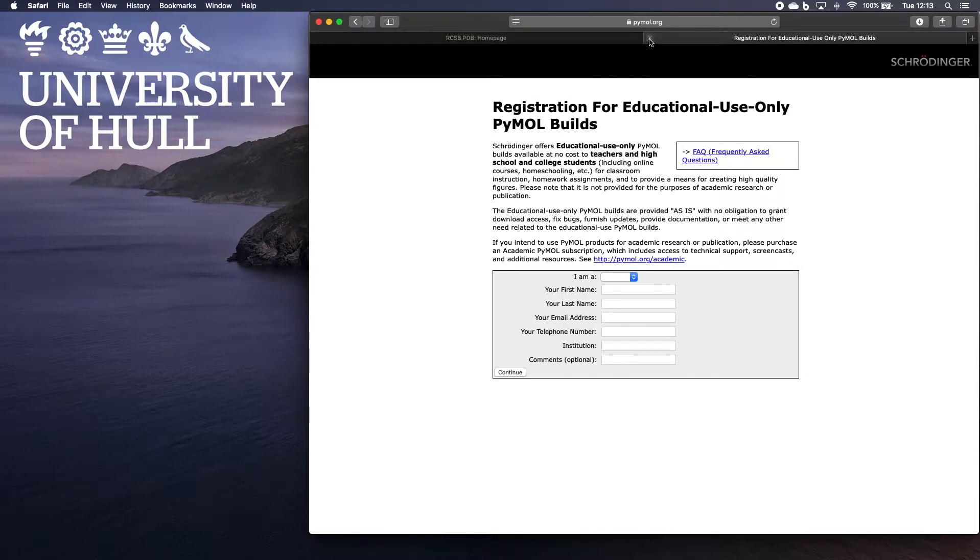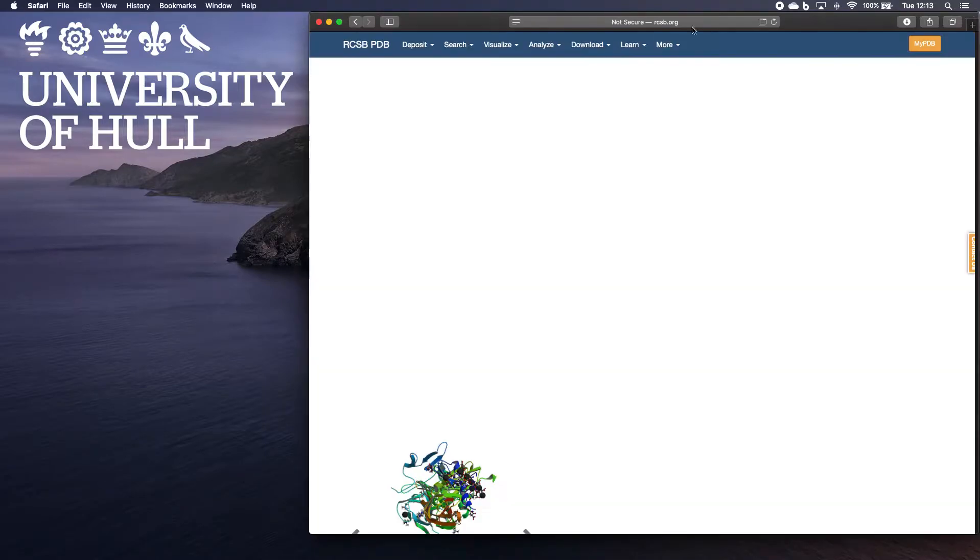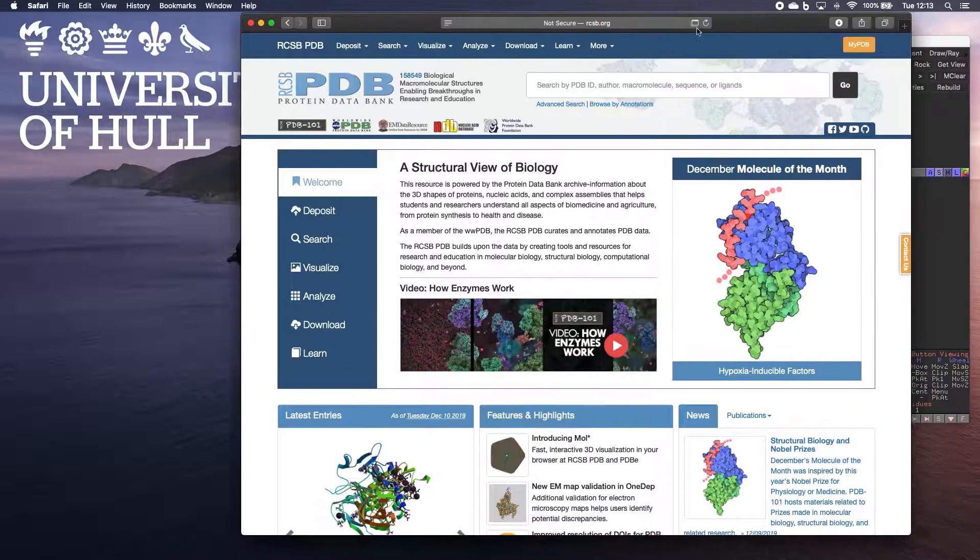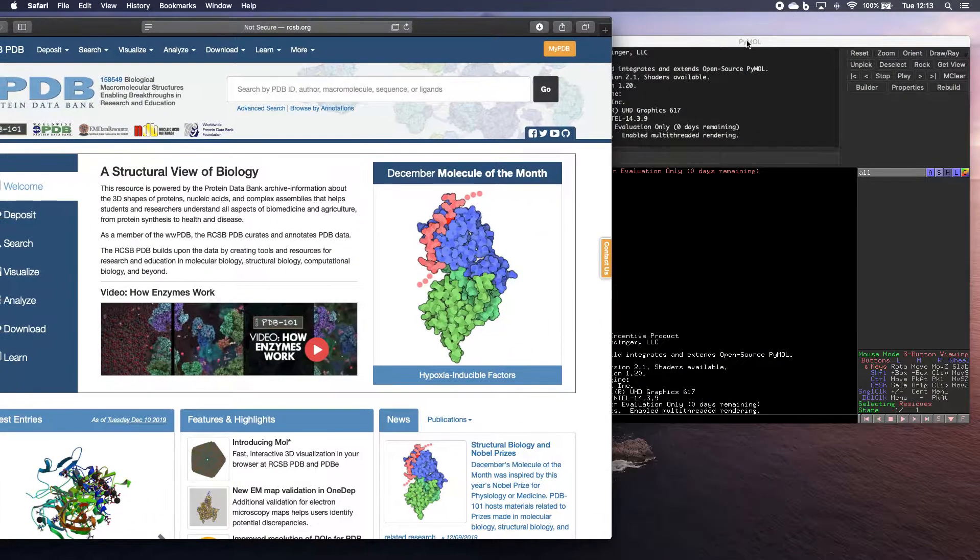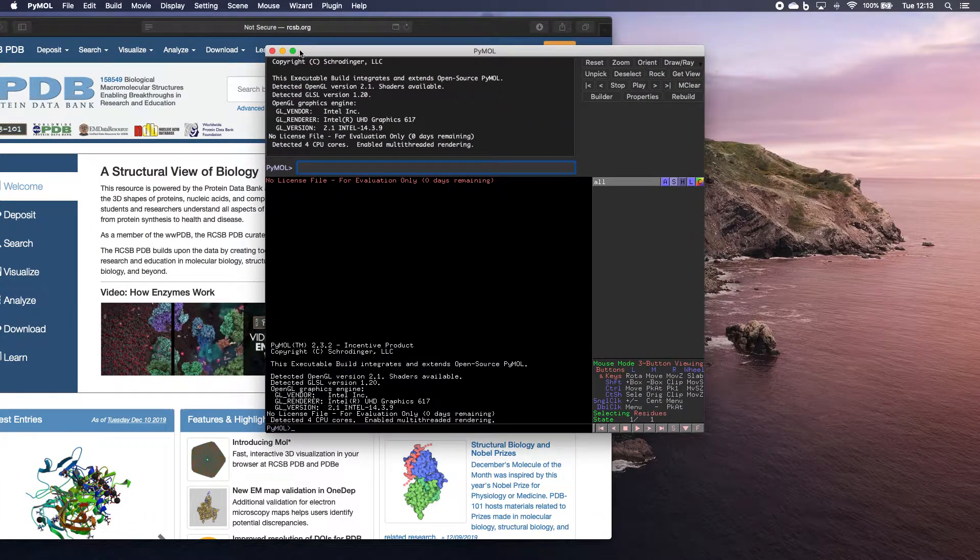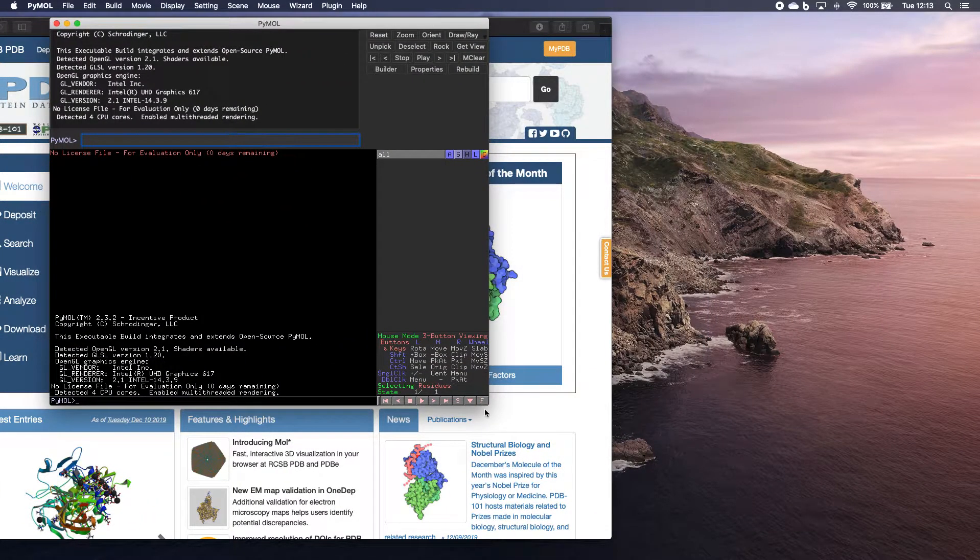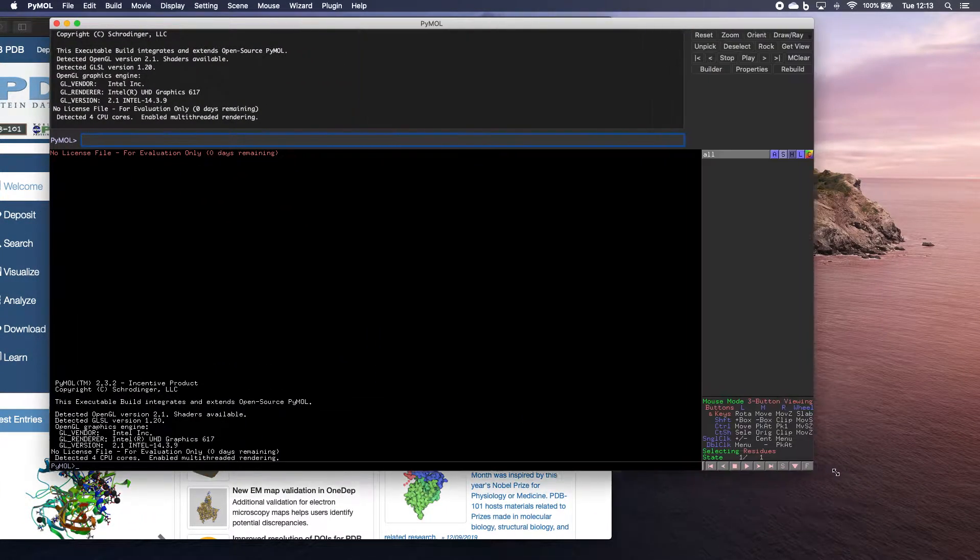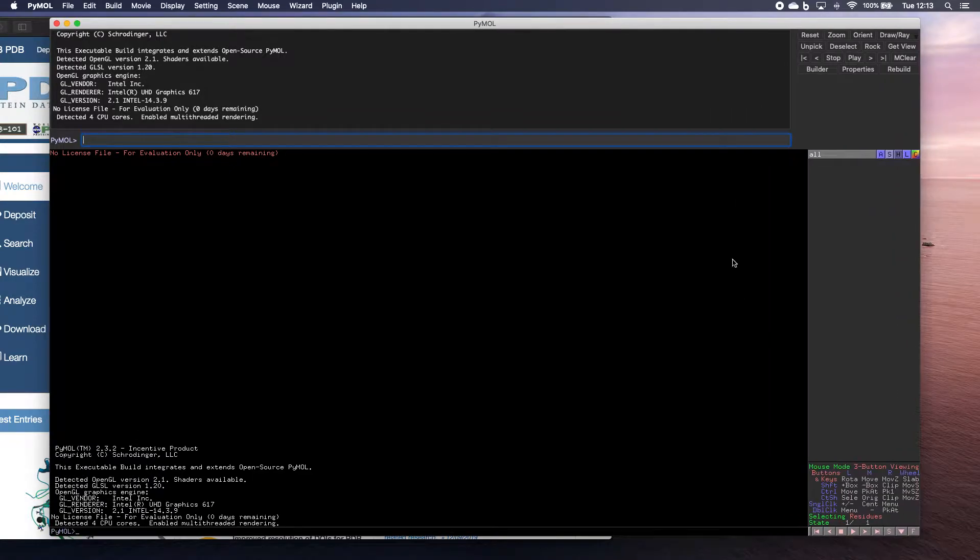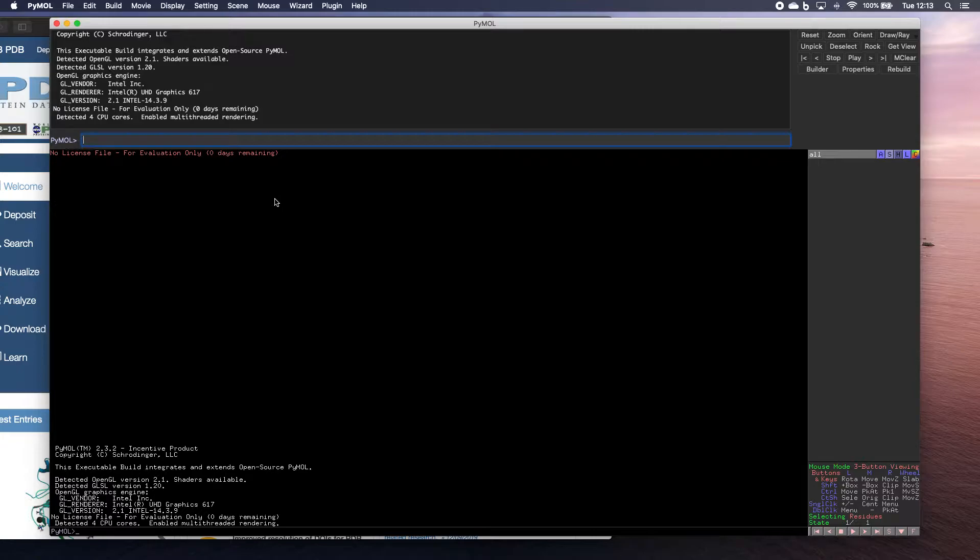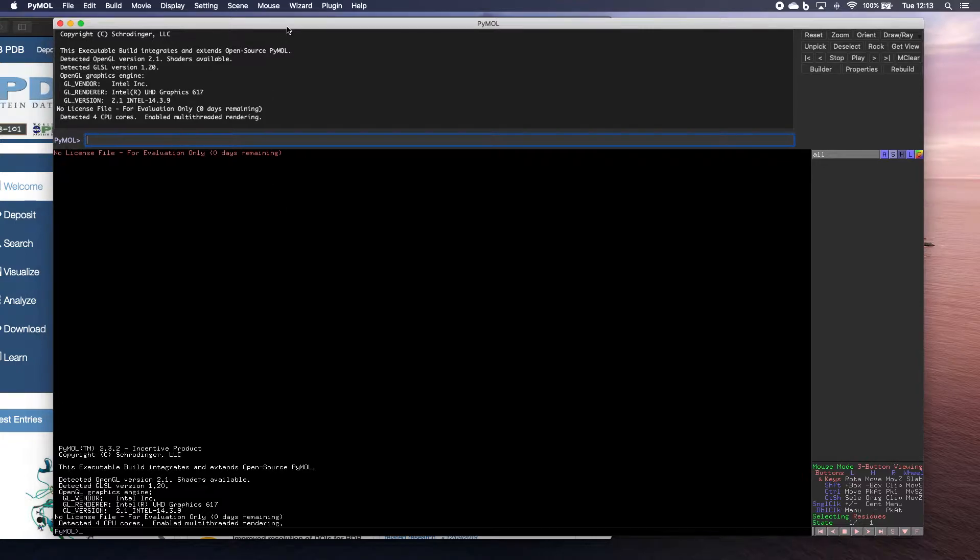So once you've downloaded Pymol, you'll see something that looks like this. And the first thing we need to do is to load a structure from the protein databank into this bit of software. Now there's a couple of ways of doing that.